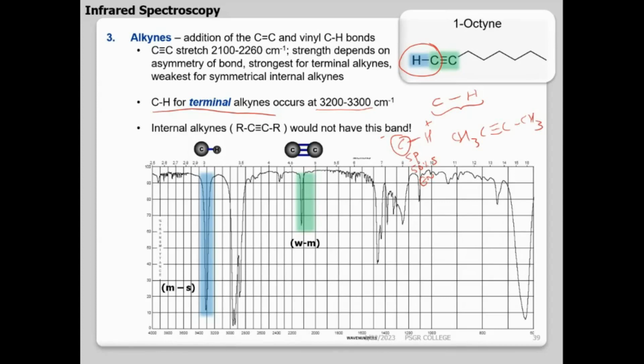So CH will have the value. This is 2-butyne. Could anyone tell me, will this molecule give me a peak around 3300? Will it give? 2-butyne, will it give me a sharp peak around 3300? No, ma'am. Why no? No CH bond. So we did not take the triple bond in the alkyne; it is the CH, the hydrogen attached to the triple bonded carbon.